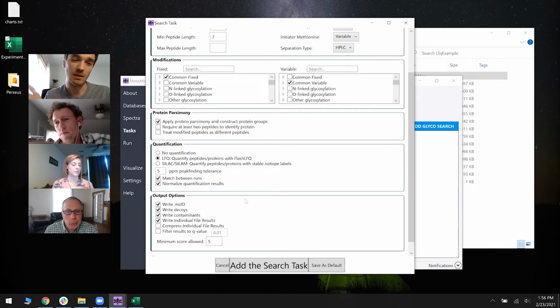So if you run 3 samples in a row, even the same sample 3 times in a row, the instrument can drift a little bit, and the intensities can decrease over time. And the other thing is that if you're running even seemingly identical samples, but they're different samples, there can sometimes be very slight systematic differences in how much total lysate you inject or whatever.